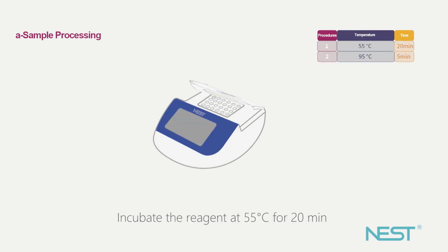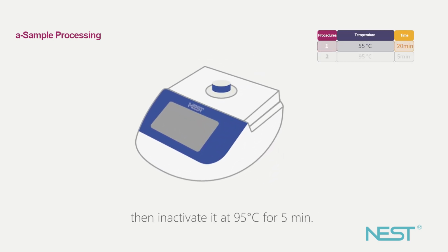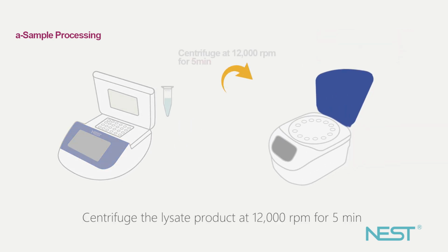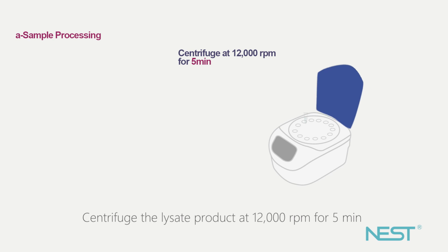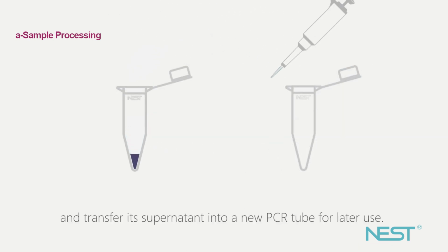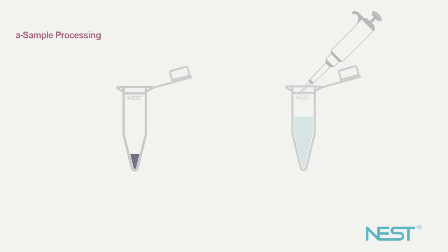Incubate the reagent at 55 degrees Celsius for 20 minutes, then inactivate it at 95 degrees Celsius for 5 minutes. Centrifuge the lysate product at 12,000 RPM for 5 minutes. And transfer its supernatant into a new PCR tube for later use.